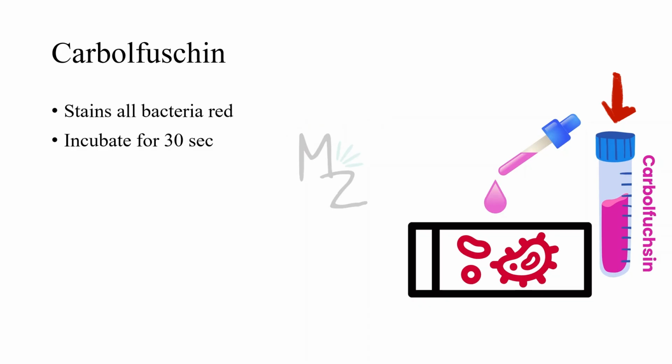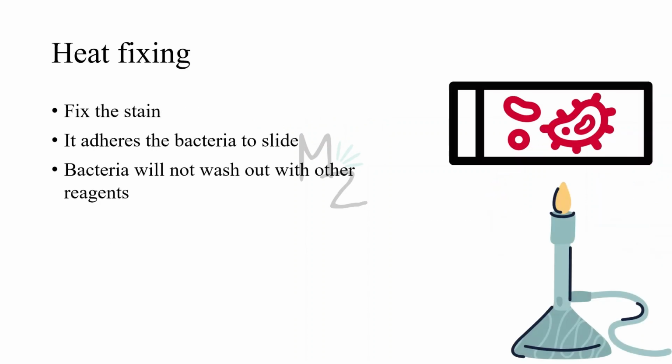It will do what? It will stain all the bacteria red, whether they are acid-fast or non-acid-fast, and it will be incubated for 30 seconds, and after 30 seconds all the bacteria will be red, as you can see there on the slide. Step 2, heat fixing or fixation.